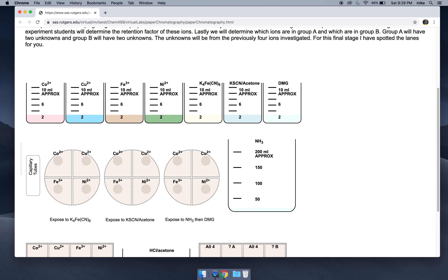All right, now we're going to expose them to developing reagents. There's going to be some color changes. Let's look at our first developing reagent, K4FeCN6. We're only going to expose this first piece of paper to this developing reagent. We see we get a reaction for the copper and the iron, but no reaction for the cobalt and nickel. The copper turns red and the iron turns blue.